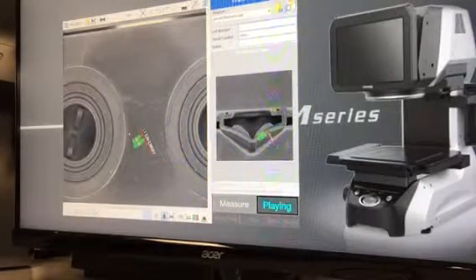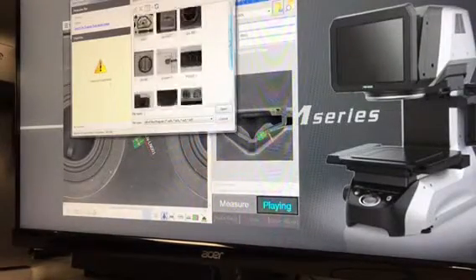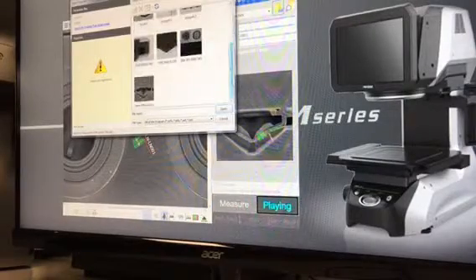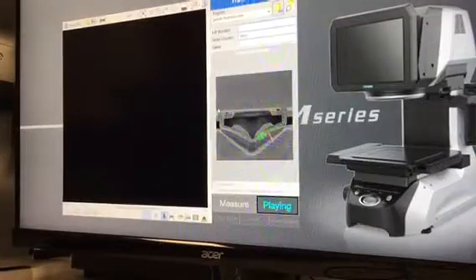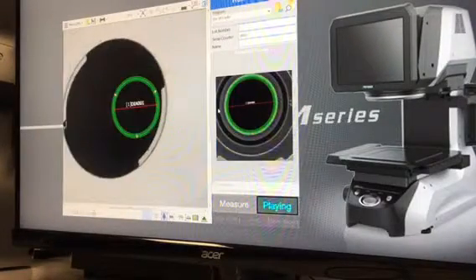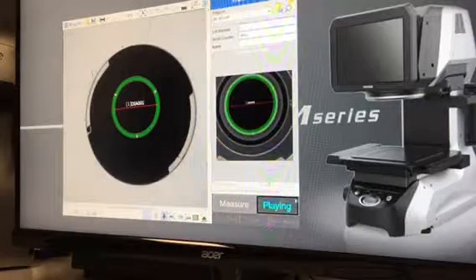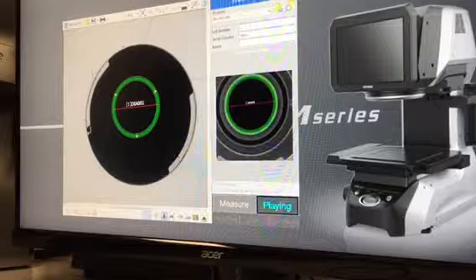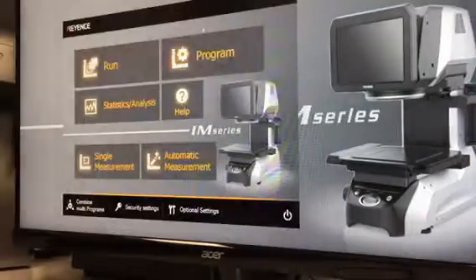So basically this one I wrote, the one we're using already. So let's say that one, open this. I'm going to try, at least at this one, so we can get, because like I said... How come it doesn't show this? Because you're in run mode. You're not going to edit. Sorry, edit.